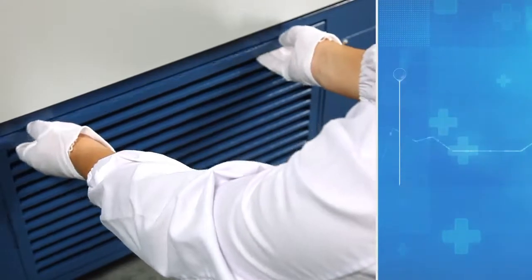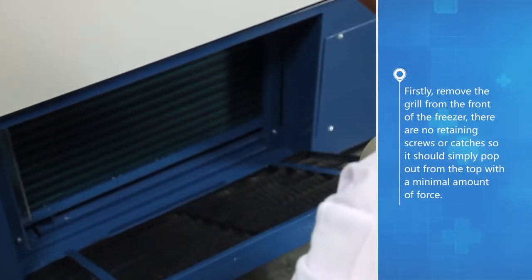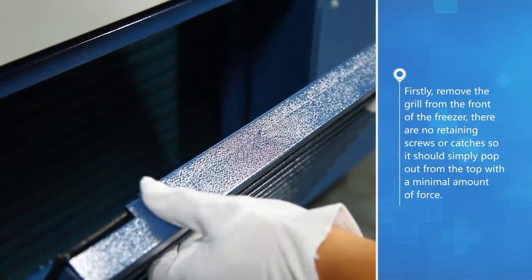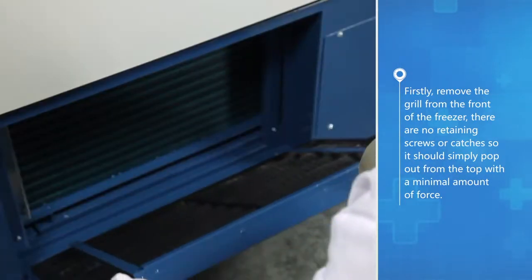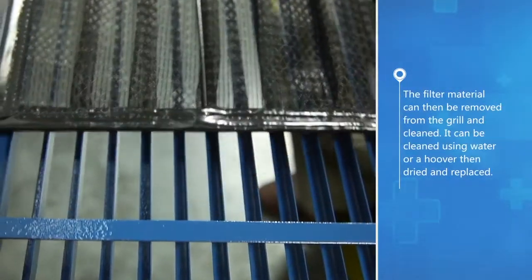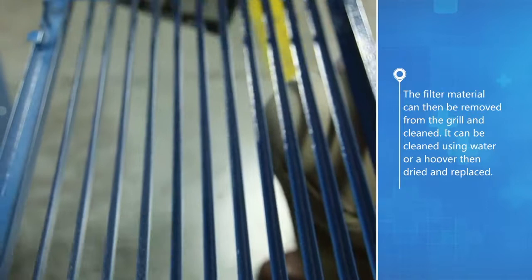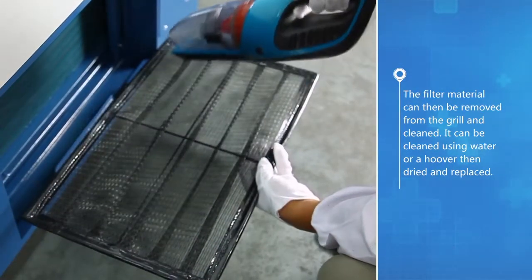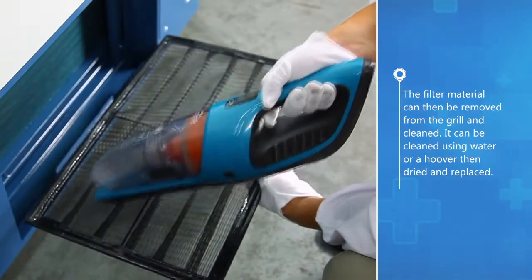Firstly, remove the grill from the front of the freezer. There are no retaining screws or catches, so it should simply pop out from the top with a minimal amount of force. The filter material can then be removed from the grill and cleaned using water or a hoover, then dried and replaced.